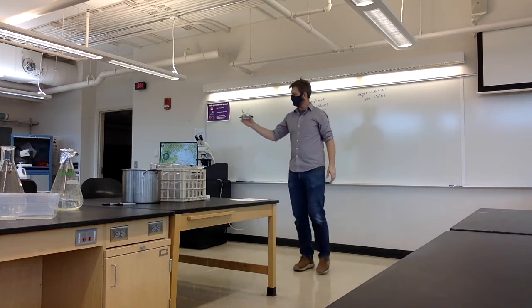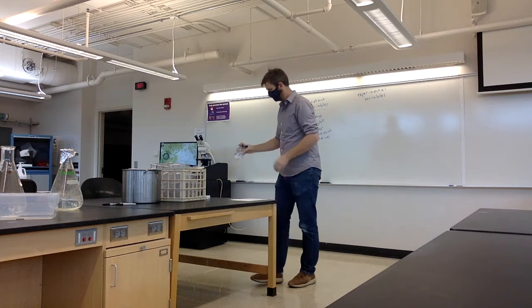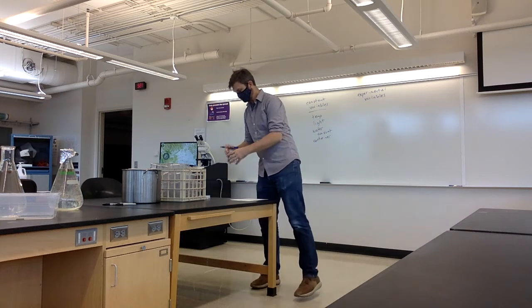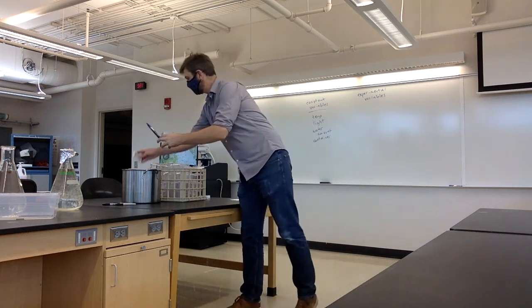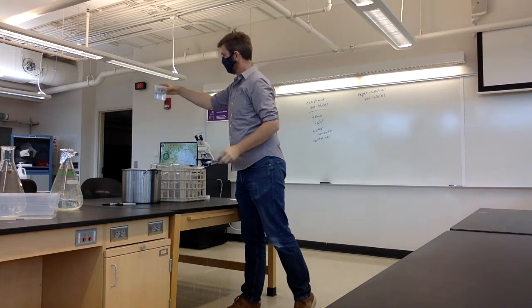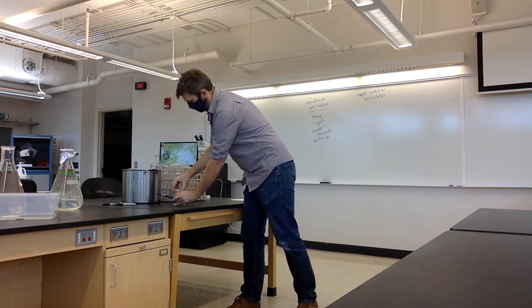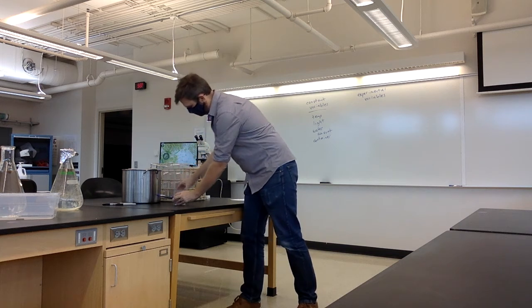So the amount of water will be the same to start with. The type of container will be the same across treatments. Little lids we can put on there, so the lid will keep them self-contained, keep them from drying out faster. And let the light in.